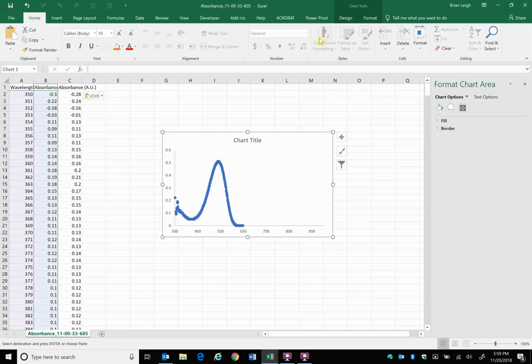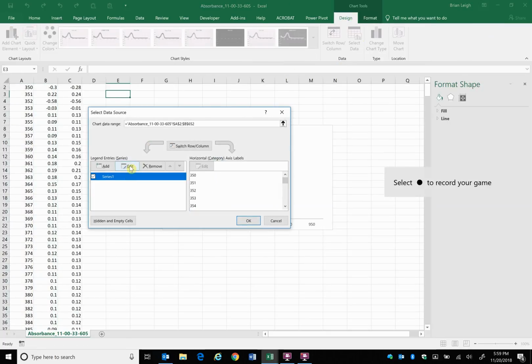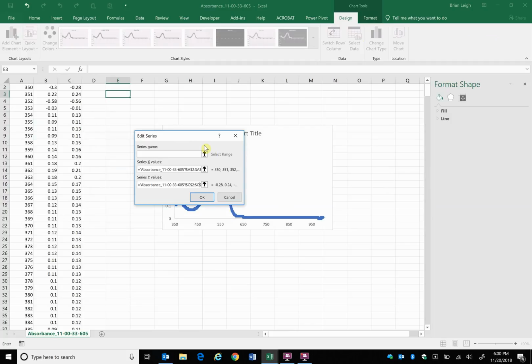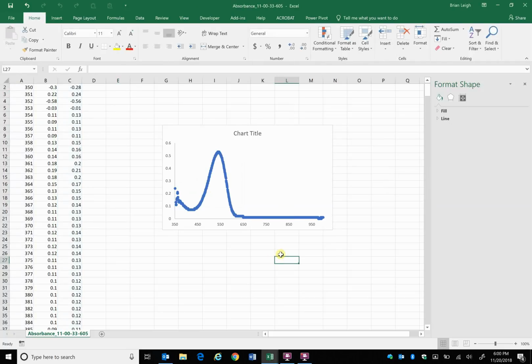So you go back here, we would say, hey, we really don't want to use that B column. Instead, for our Y value, we want to use the C column that has been slightly adjusted up to correct for that 0 offset. And ta-da, everything's been brought up just a hair, and your values are pretty much all the same, so you don't have to worry about it. Now, if this was a huge offset by a much larger number, then you may want to be concerned about it, but 0.02 really isn't enough to be concerned about. So now you have your beautiful chart.